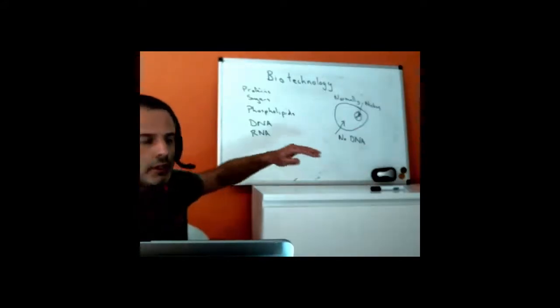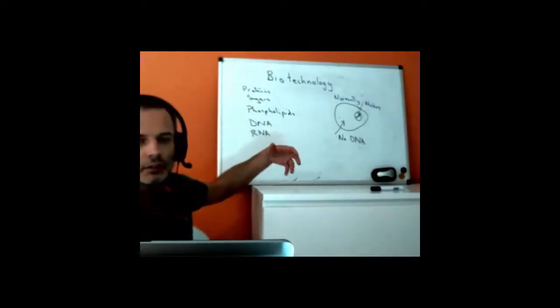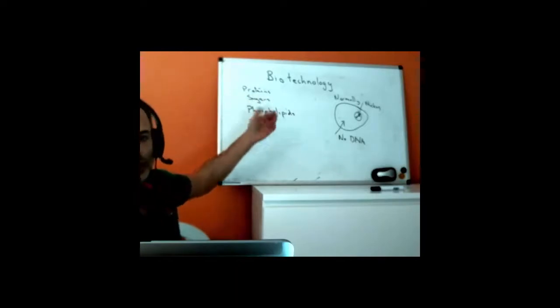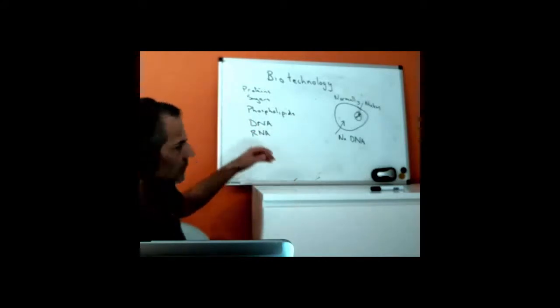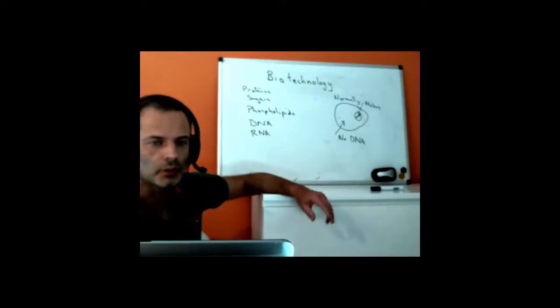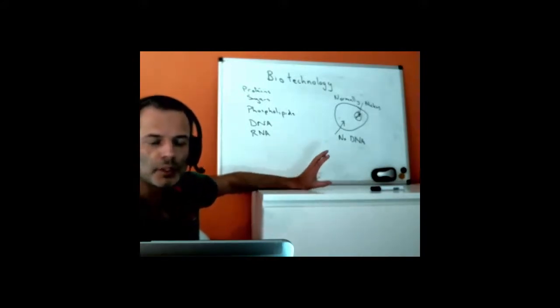So now what we've generated is effectively soup. We've got the inside of the cell and let it all out, and we've now got a mixture of proteins and sugars, different lengths of sugars, phospholipids, that was the cell wall, but also fat deposits, DNA, RNA, and anything else that was in the cell, so salts and things. However, now that we've done this, we've committed a crime and we have to do something very quickly.